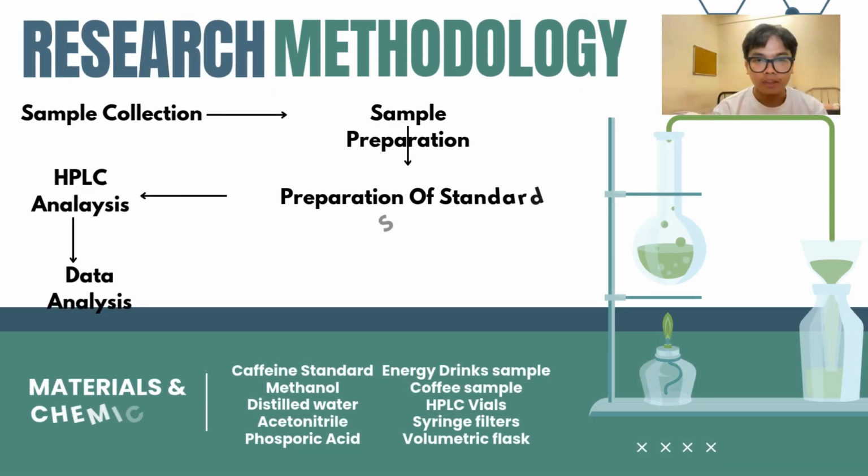Then we have the research methodology. First, sample collection. We collected different energy drinks and prepared brewed coffee samples for analysis. Second, sample preparation. The energy drinks were degassed to remove gas, and both the energy drinks and coffee were filtered to remove small particles. The samples were then placed into HPLC vials.